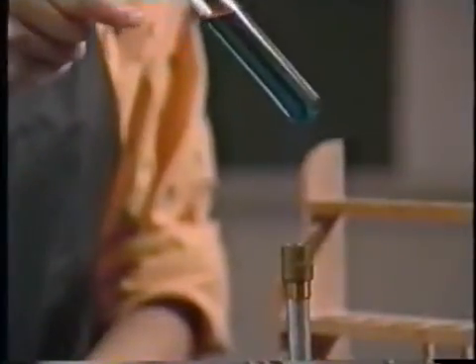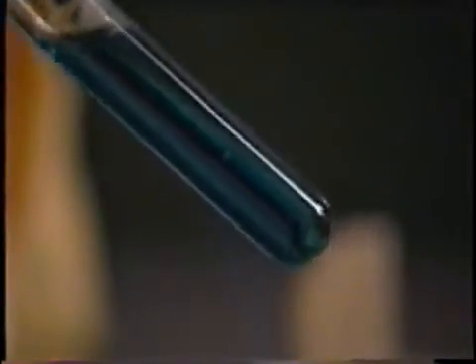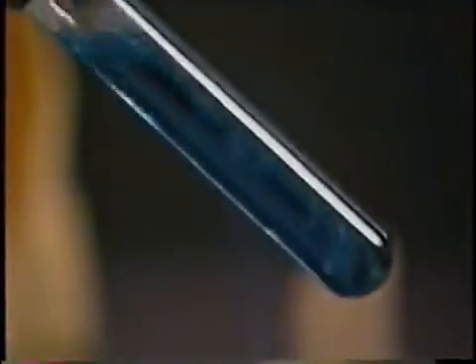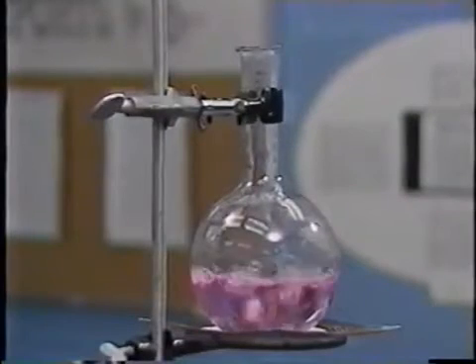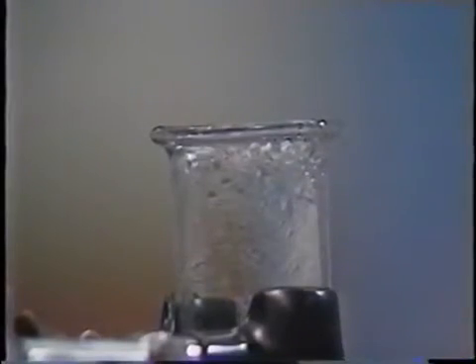You can also heat a test tube directly in the flame. Hold it at an angle while moving it back and forth to distribute the heat evenly. Aim it away from yourself and your neighbors in case it boils over. Only heat containers with openings — a boiling liquid changes to gas, which must be able to escape. Gas can't escape from a closed container, and the pressure that builds up can burst it.